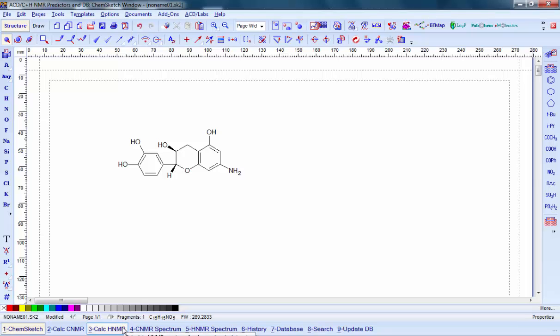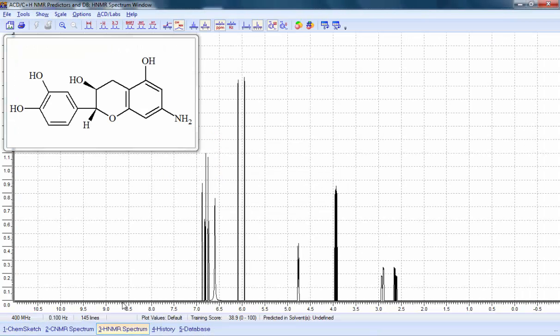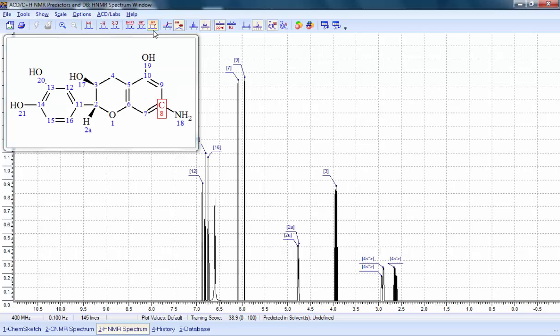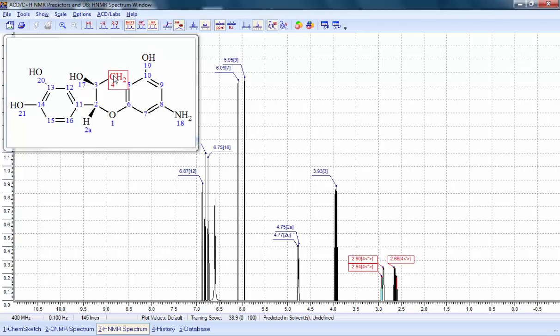Once we have the structure, just click on the specific NMR spectrum you'd like to calculate. We turn on our labels, and now we've got an interactive display of the assigned spectrum.